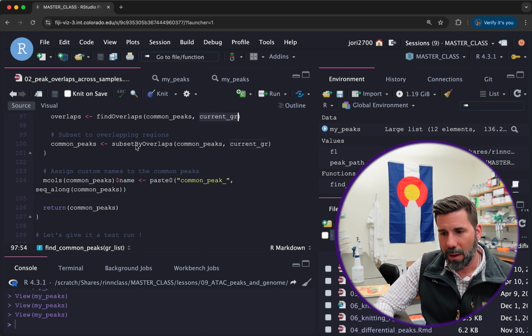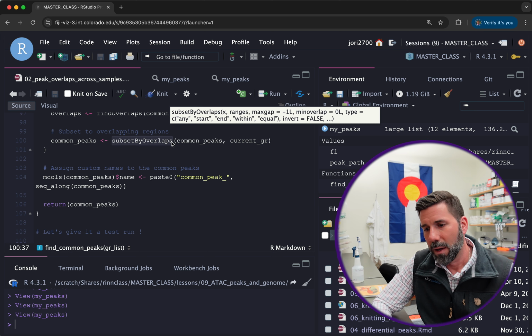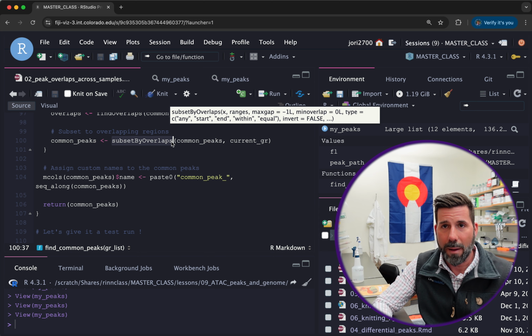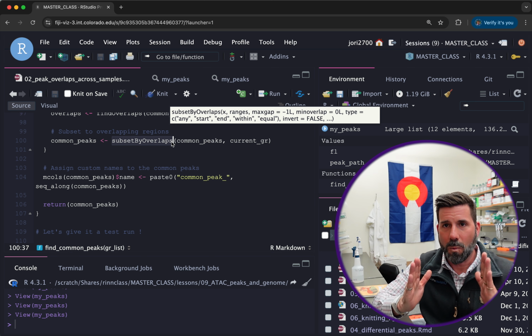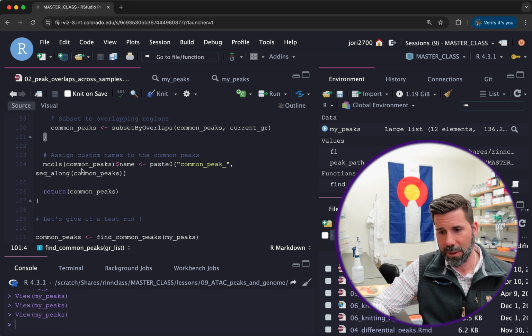Okay. And then we can use subsetByOverlaps to just reduce it to common overlapping regions and not worry about the @to, @from we went over. You can dig into it more, but basically it will give us a more easily accessible set of overlapping peak intervals of a chromosome start and stop, and where the two files had an intersecting peak. If they overlap perfectly or like that, they would be counted as one region of a peak. And that's what subsetByOverlaps is going to do.